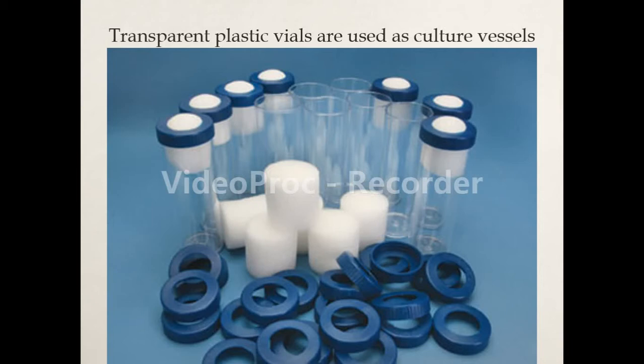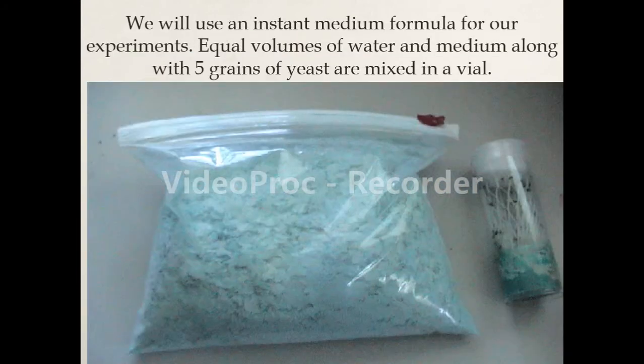So what are the chemicals that are used for culturing? Both glass and plastic bottles are used. The bottles used for storing the Drosophila are basically plastic-like transparent bottles, considered as culture vessels, easily available in the market and in laboratories and institutions.